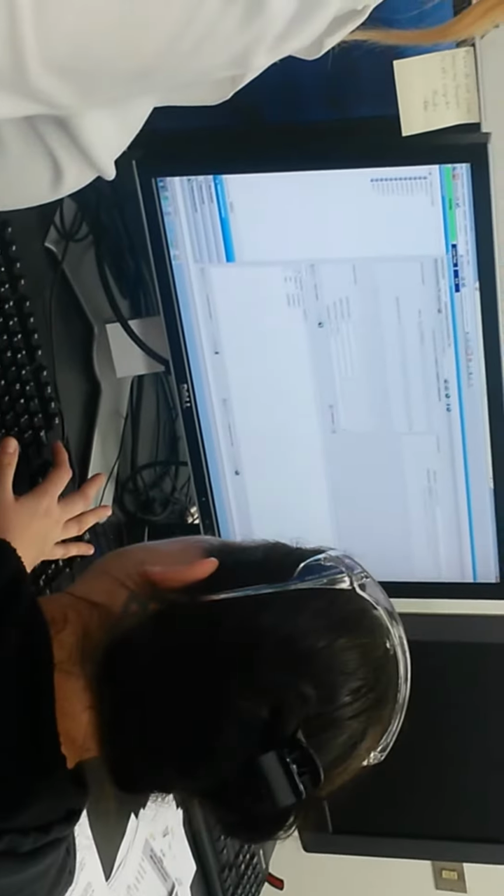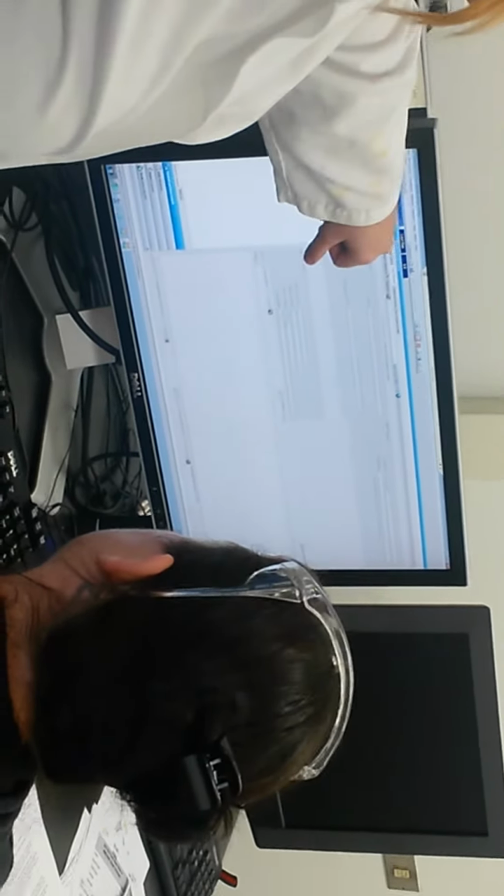And you see how you did those 3 things? The 3 things showed up on the left-hand side, those drop down. Easy sequence. Load your sequence, or it's already loaded for you. Change the name. What's your file number? Now save that. Now the cool thing is you can actually watch it. If you go to instrument controller, it's going to show you that it's going to start. And now you've started. Now the next person can come in.